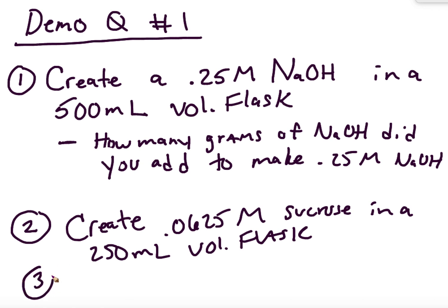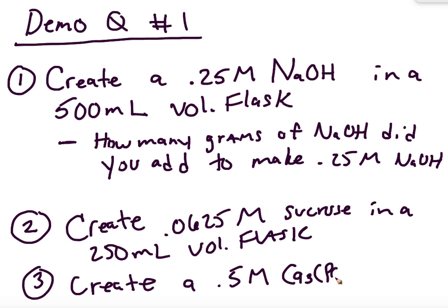And then the third one, we are going to create, let's say, a 0.5 molar calcium phosphate solution in a 1 liter volumetric flask.